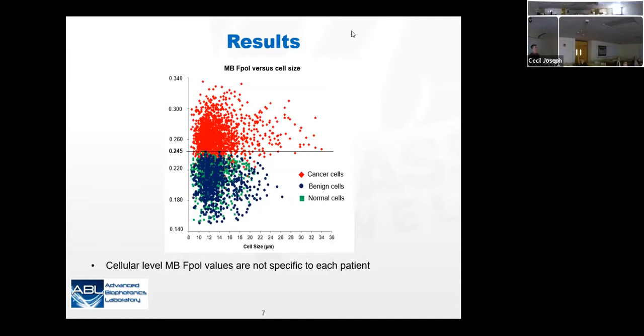And how long does it take when you aspirate the cells? What is the protocol at the very end for the pathologist? They aspirate the cells, put them on the plate, and then put the specific concentration of methylene blue on it, and then you wash it a little or not. You make the sample to remove the excess dye, rinsing the methylene blue in the suspension so that you can only characterize the cells, right? Yeah, we rinse three times, to remove background. That's what we're currently working on, trying to reduce how long the procedure takes.